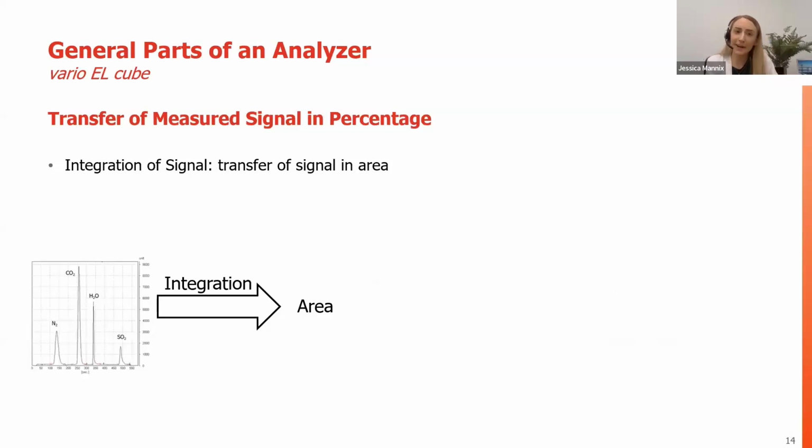How do we get from this peak area that's obtained to the actual analyte concentration? What we're doing here is taking a look at the chromatogram, just trying to extrapolate the idea of how we get from this to numerical values. What we see here is our N, C, H, and S peaks. And what happens is integration. That happens automatically within the software.